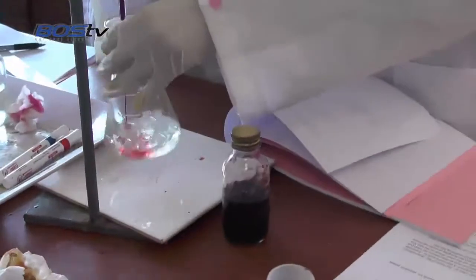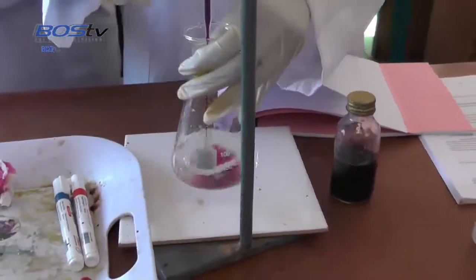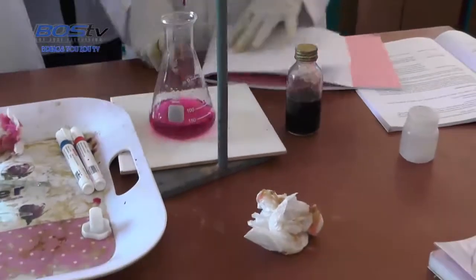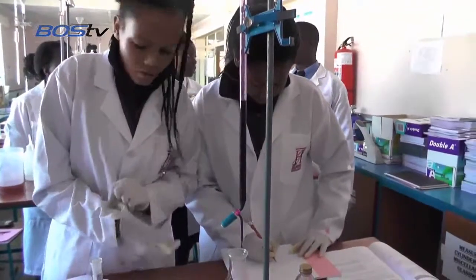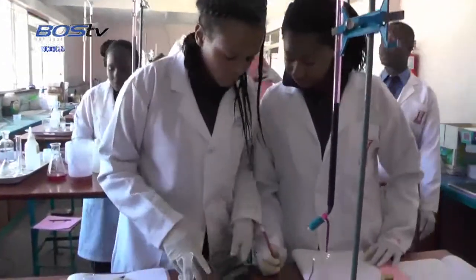The difference between the first one and the second one. That one was 26. Then the accurate one is 28. The rough titre was 27. Then you are supposed to do 3 accurate titres.